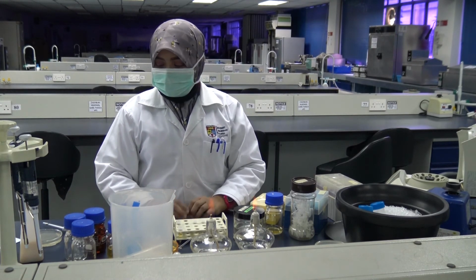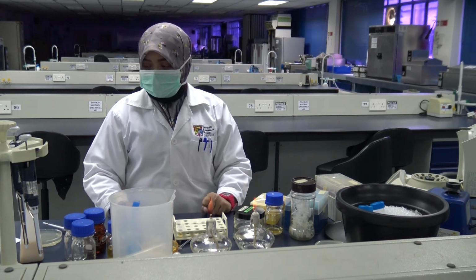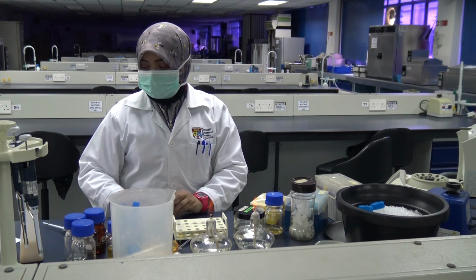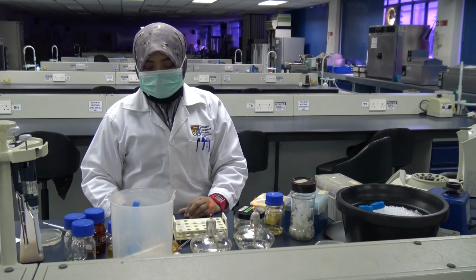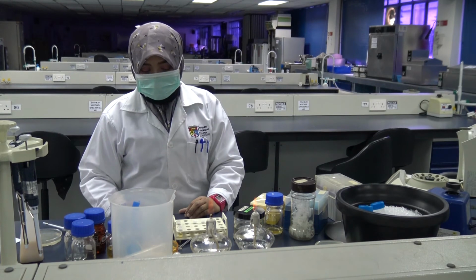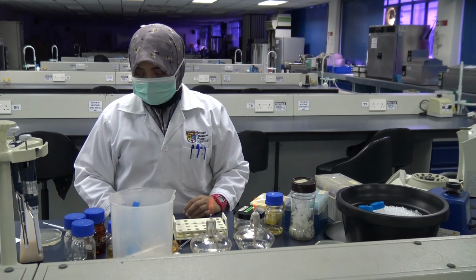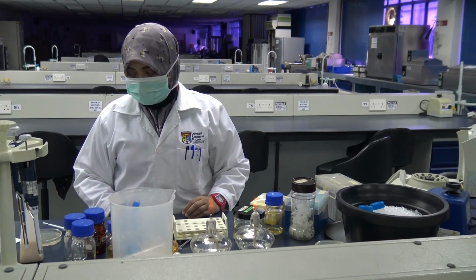What we do next is we remove about 80 to 90% of the supernatant from each of these tubes, from 10 to the minus 4, 10 to the minus 5, and 10 to the minus 6, leaving only about 100 microliters of the supernatant, and you repeat the same thing. You then mix the cell pellet with the remaining supernatant, and then transfer everything onto the plate.